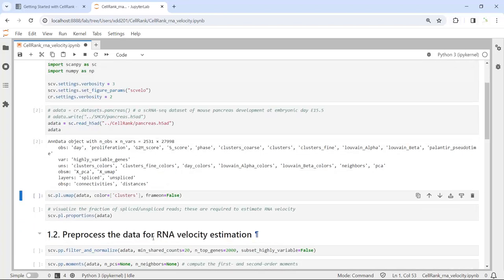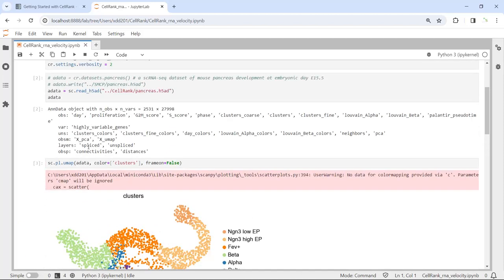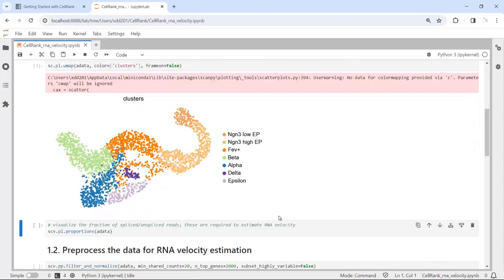Now we can look at the cell clusters. In this dataset we have 7 cell clusters: NGN3 low and high EP cell clusters, which are progenitors to generate beta cells, alpha cells, delta cells, and epsilon cells in the pancreas. Looking at the AnnData object, we also have spliced and unspliced layers in this dataset, which are required to perform RNA velocity analysis.